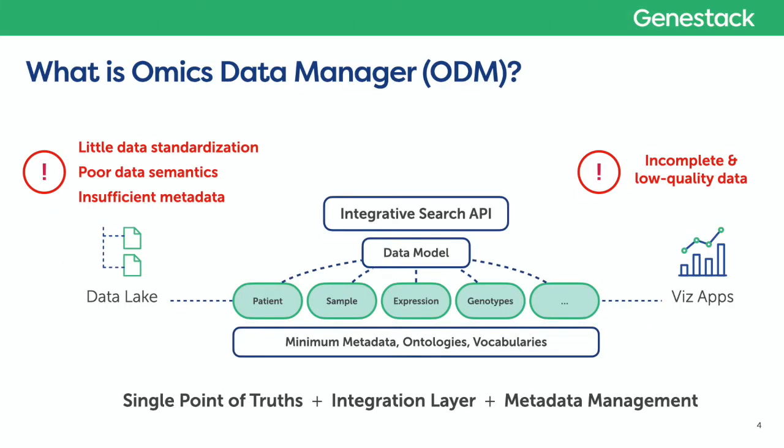So what is ODM? ODM fills the gap between data lake and visualization and analytics application development. On one end, data lakes tend to lack data standardization, data lineage, and sufficient metadata management.